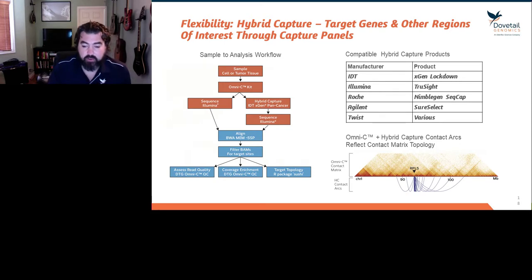And I've been able to not only enrich the data for that one specific gene, RPL5, but we're now able to ask the question, what other genomic regions does RPL5 have significant interactions with, which are depicted there by that arc? So if you already know that you have a gene of interest, you can now start asking the question, what is this gene interacting with? And are there SNPs upstream or downstream of this gene, or even within that gene, that impact the connectivity between the rest of the chromosome? Or if there's a translocation event, if it interacts more frequently with a chromosome that's not where it lives.